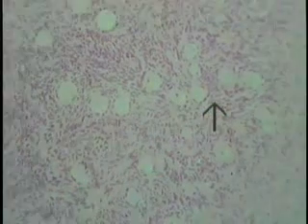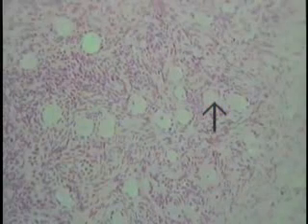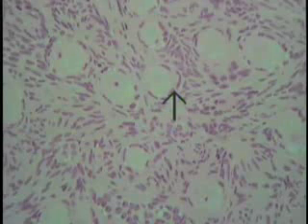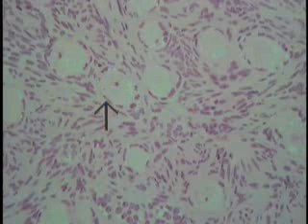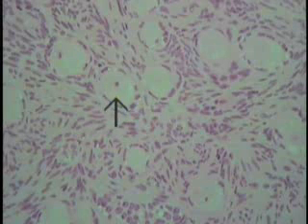So these are extraordinarily large cells. Clearly identify or have organized in your own mind what these structures are. Looking at this particular field, once again at increased magnification, this structure here indicates the perimeter or the overall circumference of an individual cell. So this indicates a cell. This structure here is representative of a cell, as is this large spherical structure, and this one over here as well.